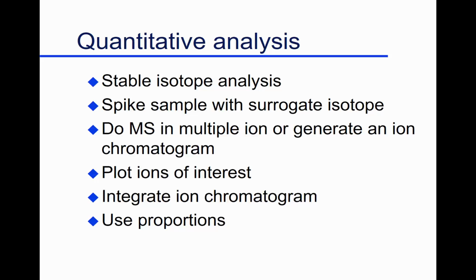Remember, it's plotting mass, it's looking for mass. So we could plot mass of 106 for benzaldehyde. But if we had the mass spectrometer look at 109, then that would find the benzaldehyde we put in at a known concentration, and we would get a peak for that. So it's really neat. Your reference is the same compound if you think of using internal standards for quantitative purposes.